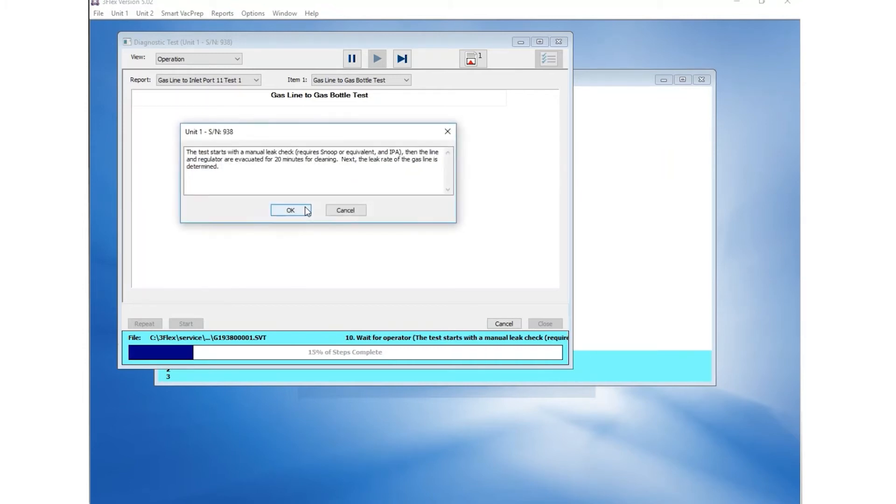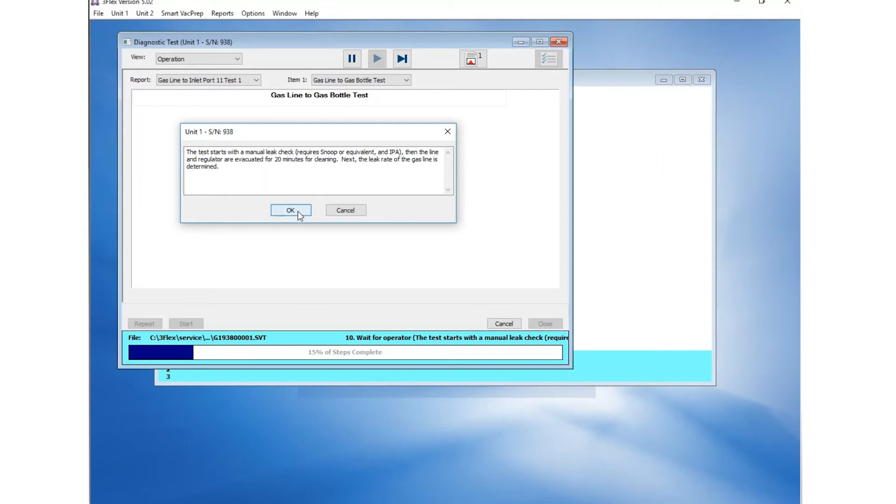The second prompt summarizes the diagnostic procedure. You will need to perform a manual leak check, which will be followed by 20 minutes of evacuation and an automatic leak rate check. Click OK.